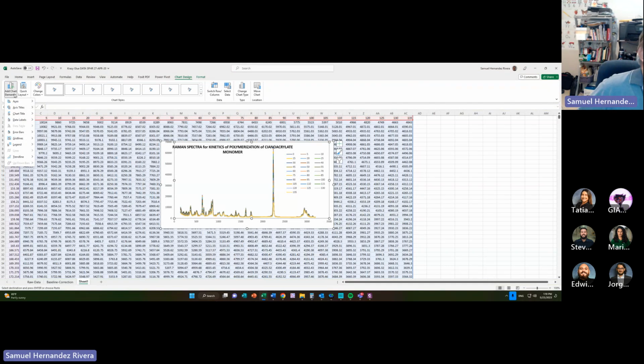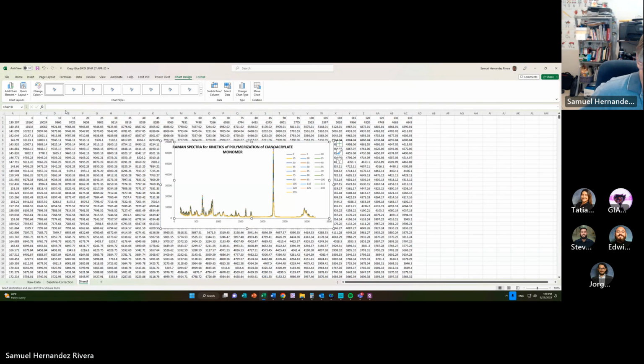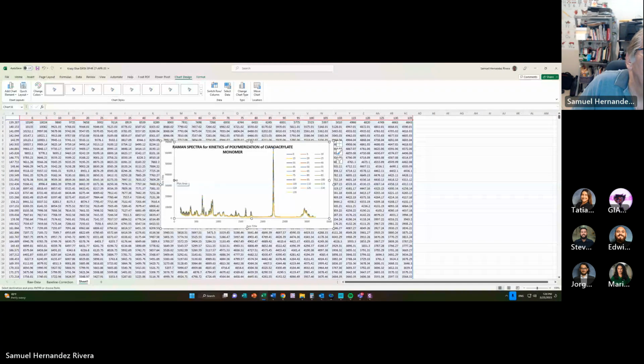We have the axis. We want to add the axis titles. And we go to the primary horizontal. That's there. And next, we go to the axis titles, add in the primary vertical. And that's there too. Okay, good.